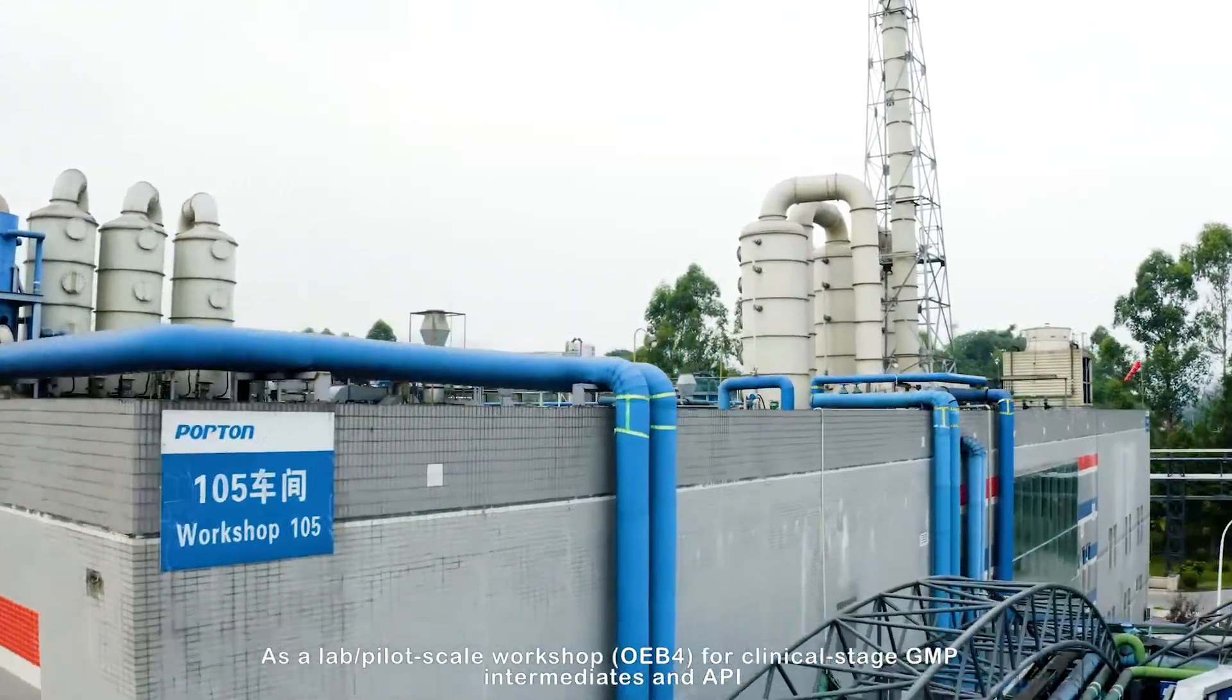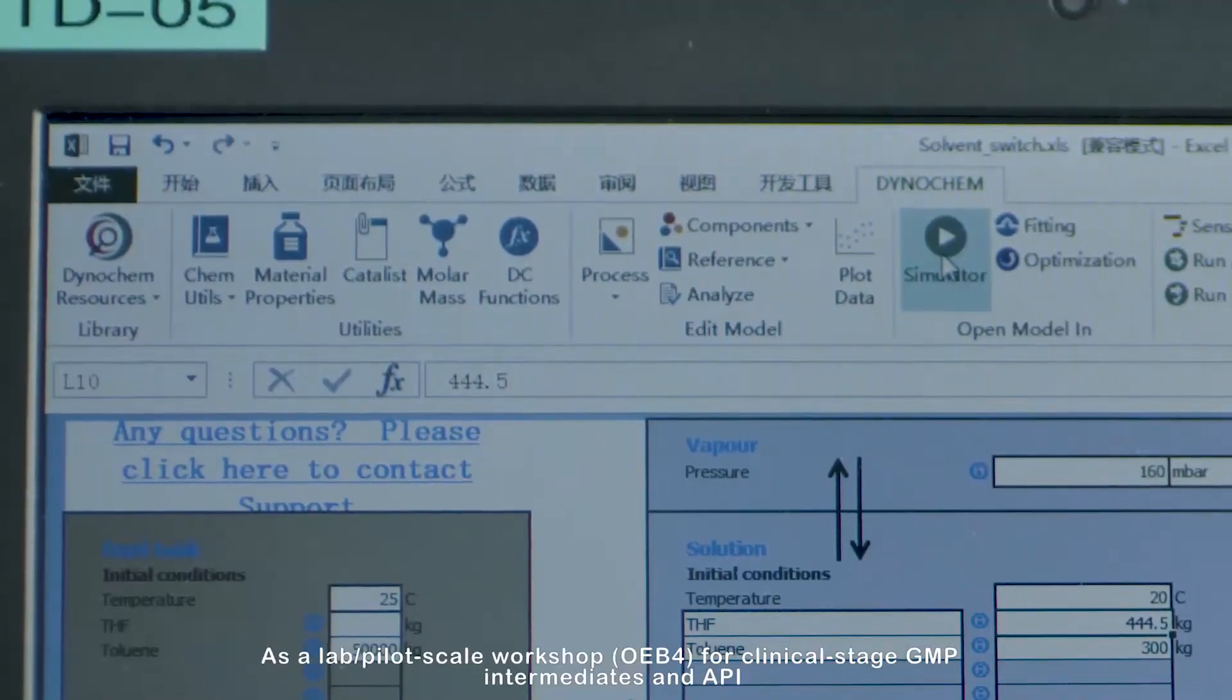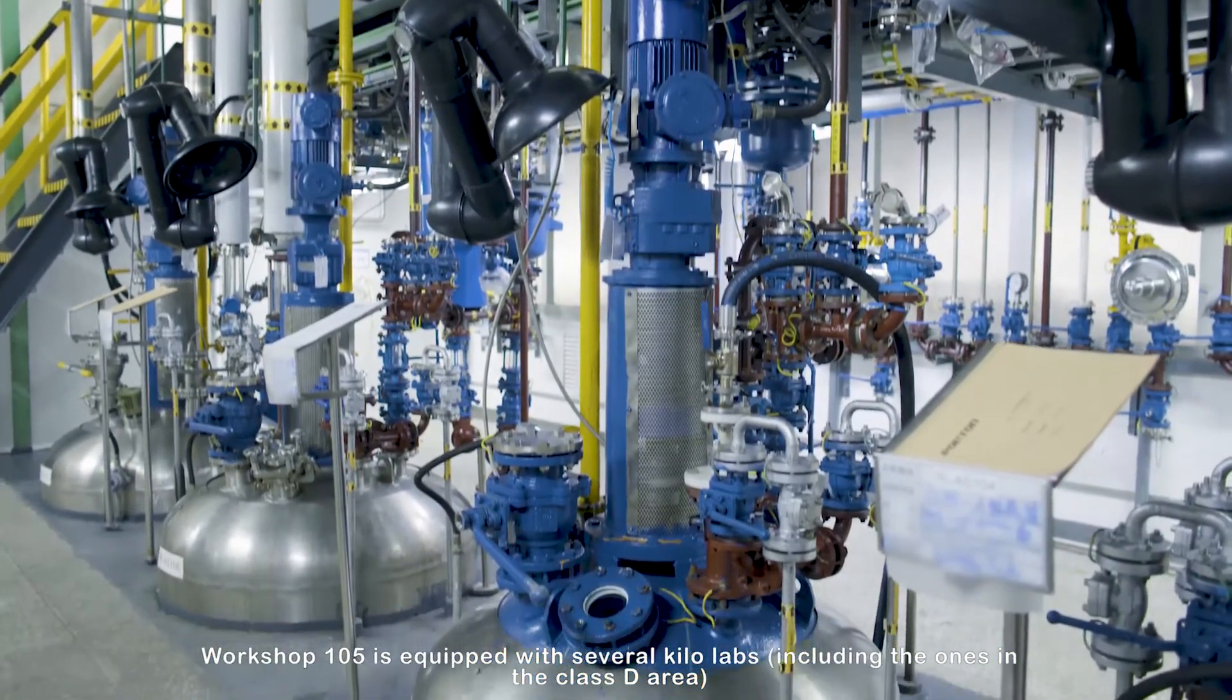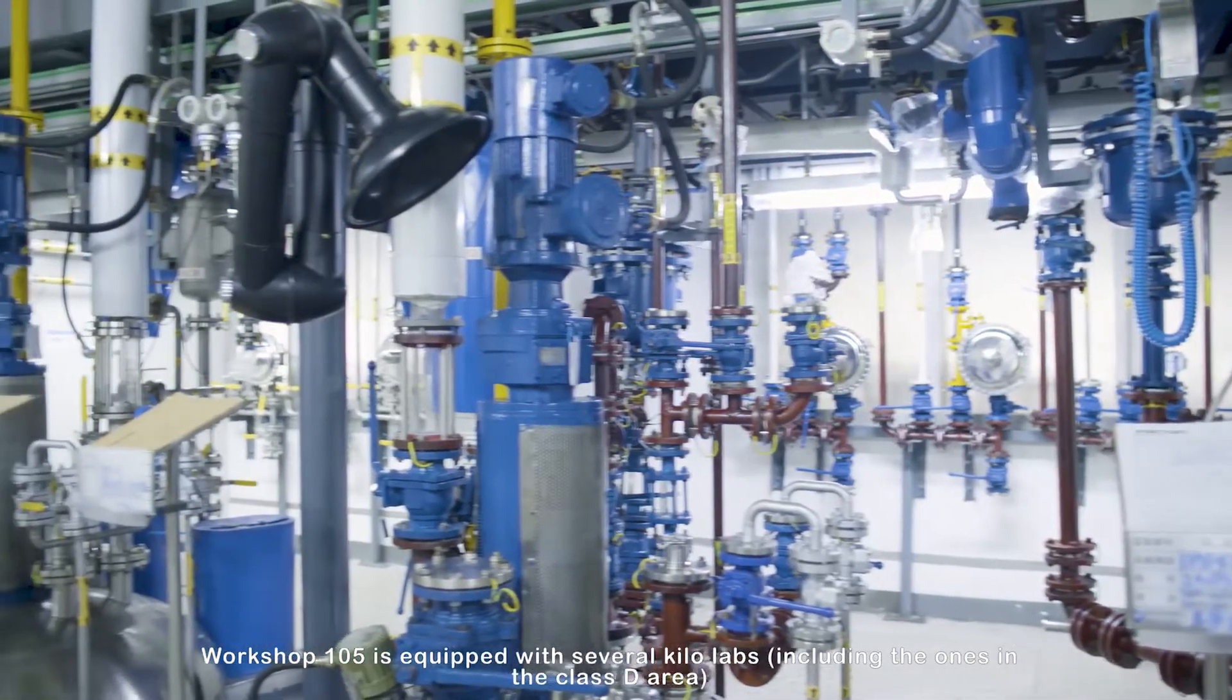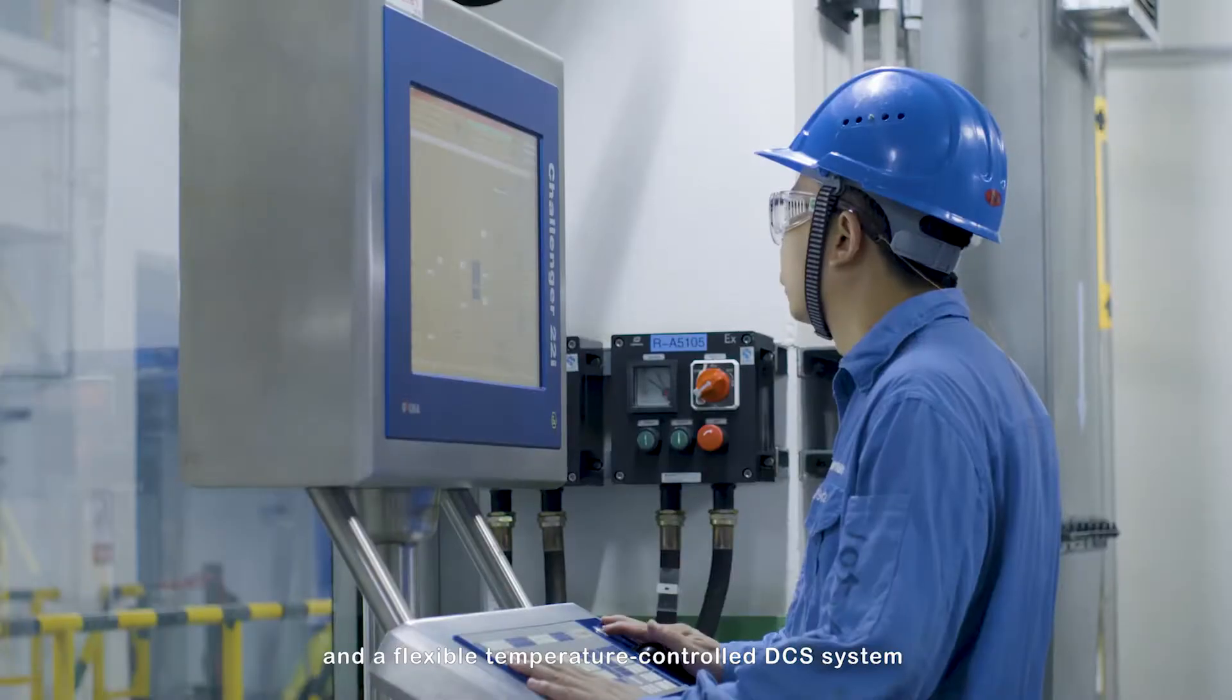As a lab pilot scale workshop OEB4 for clinical-stage GMP intermediates and API, Workshop 105 is equipped with several kilo labs including the ones in the Class D area and a flexible-temperature-controlled DCS system.